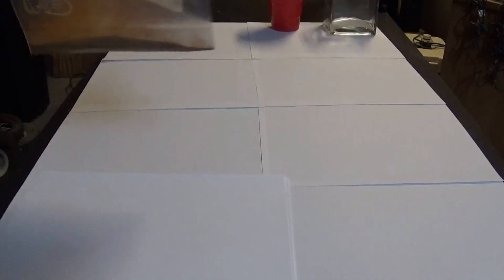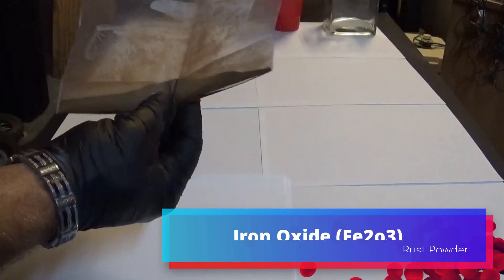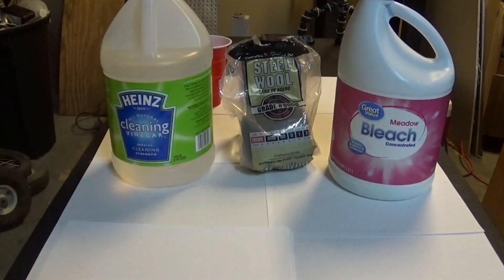Today I'm making rust powder, also known as iron oxide. For this I have a couple of simple and cheap ingredients: cleaning vinegar, some bleach, and some fine grade steel wool — the finest I could find. Either way, make sure you're wearing proper protective equipment when doing this, along with working in a well-ventilated area. There's some pretty caustic stuff involved.